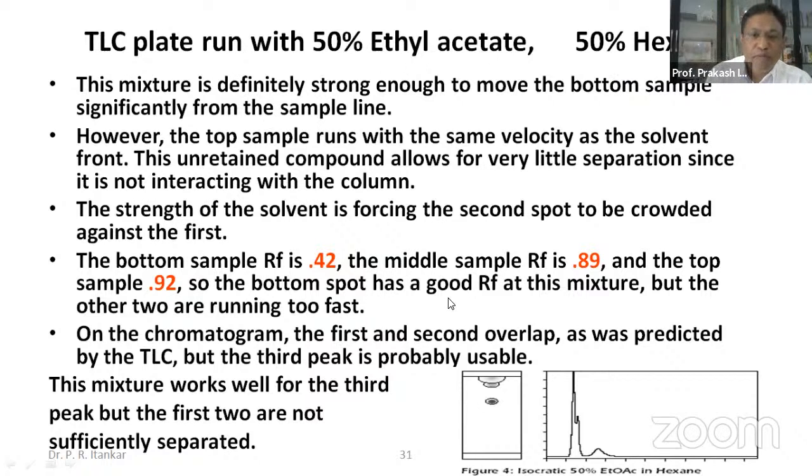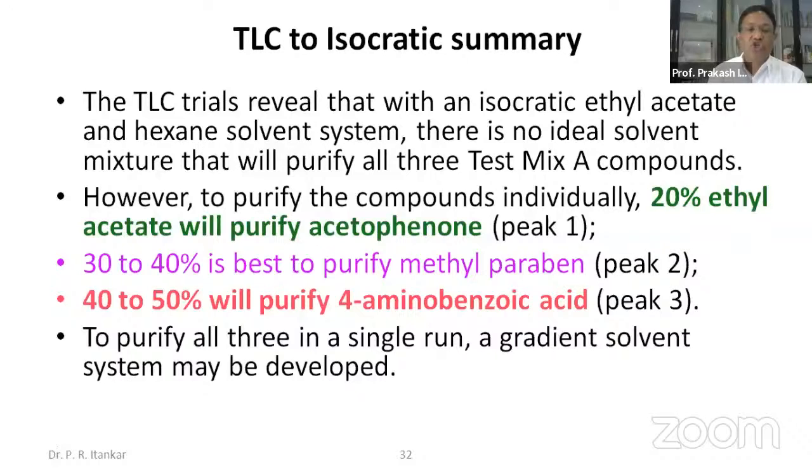Now, this kind of practice and experimentation is needed for each and every compound or composite sample, because of the variability in its nature. Moreover, it becomes very tricky if you are handling constituents which are absolutely unknown to you, and with that a lot of experimentation is needed. For that matter, a lot of practice, patience, and persistence is needed while using this particular system.